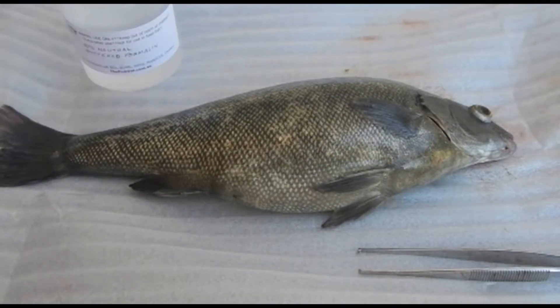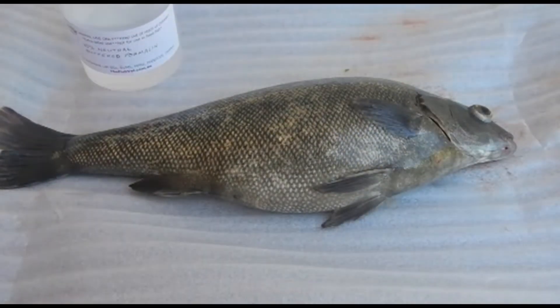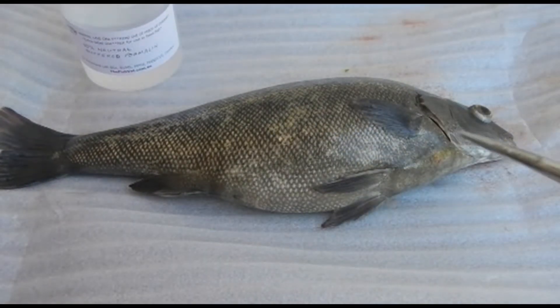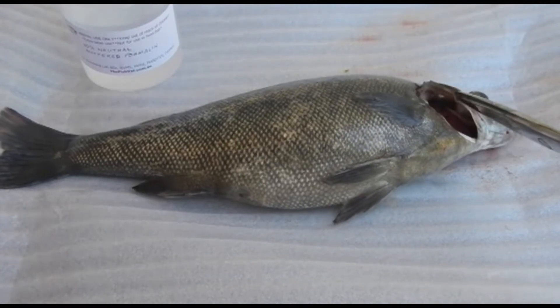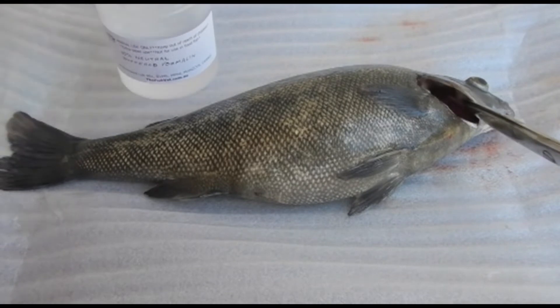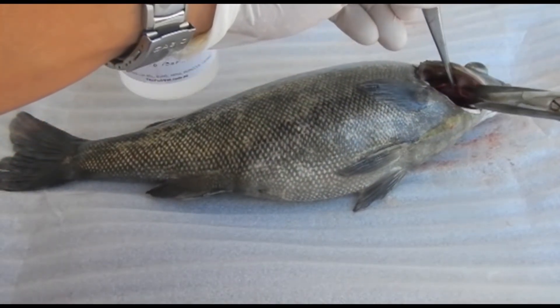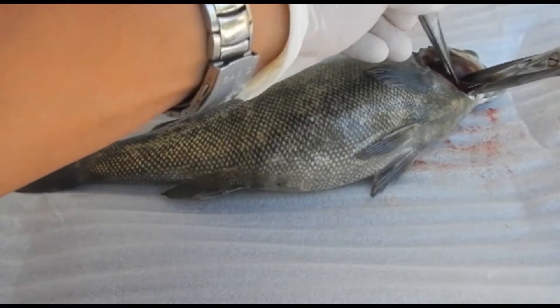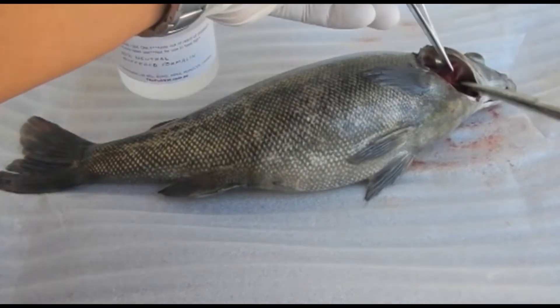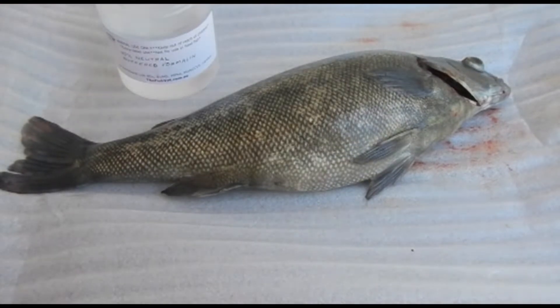Now we're getting the neutral buffered formalin ready so that we can place the organs in as we collect the specimens. The first organ we need to sample is the gills, because this organ tends to autolyze very rapidly. So it's the first thing you want to take as soon as the fish is euthanized.